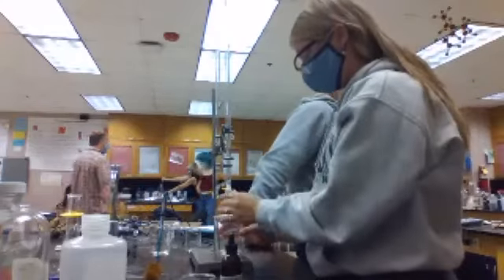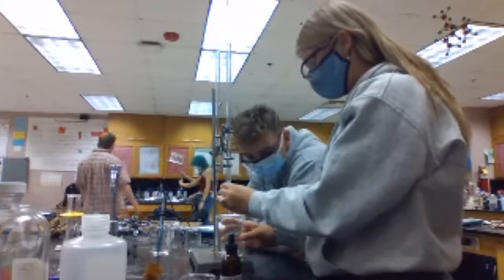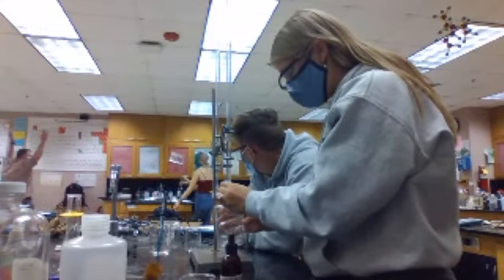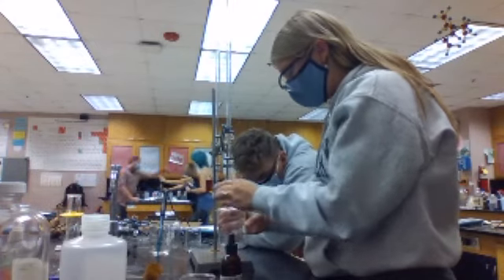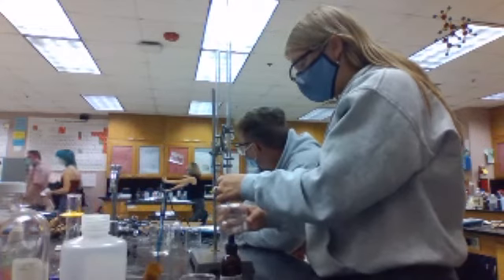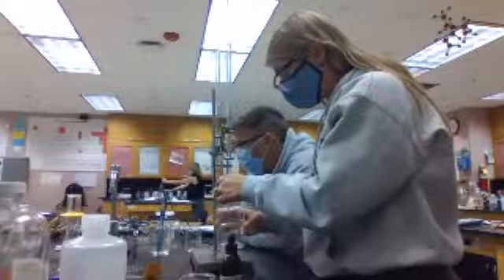Tomorrow we're looking for just the smallest smidgen. I know. That's why I was like, we have big goals in here. We don't have just tiny little goals. These 2 bowls are too big for me. I mean, this is the pink that you might wear out on a Friday night. We're looking more like an Easter Sunday dress. Okay, so for H plus, I got 0.0054.